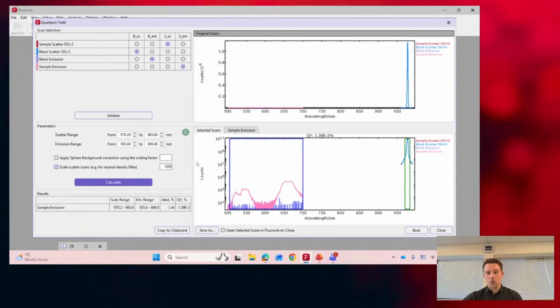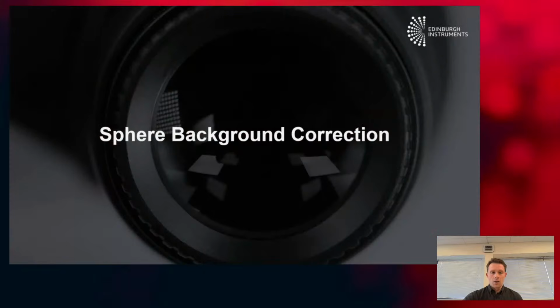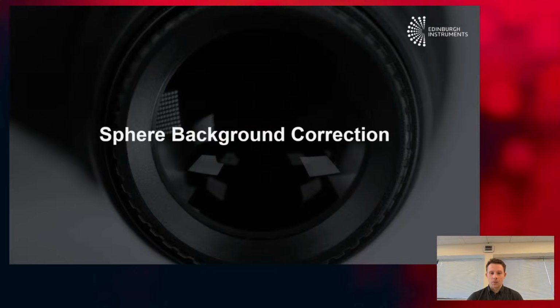And we can calculate our PLQY, that it's 0.014%, so really low. But there we've done it, collected our data and measured the PLQY of this upconversion sample. So I'll hand back to Grant, who's going to go over doing correction for sphere background, how to do this correction.